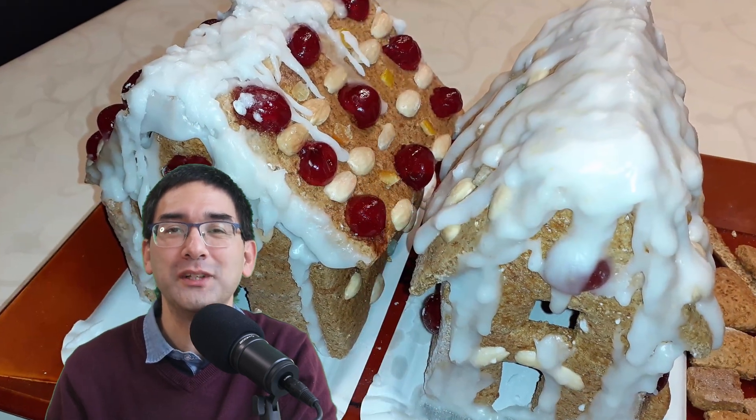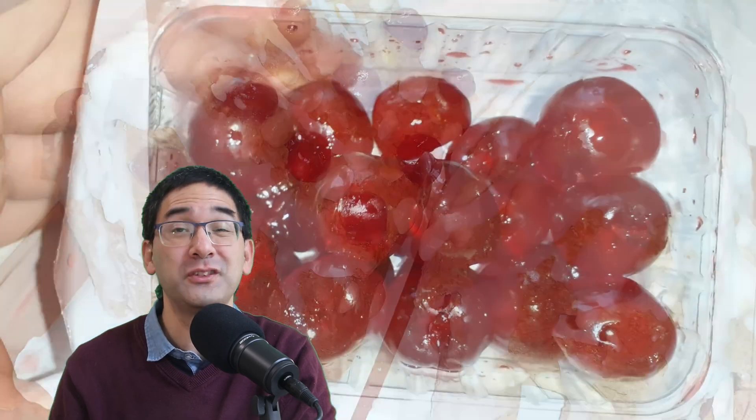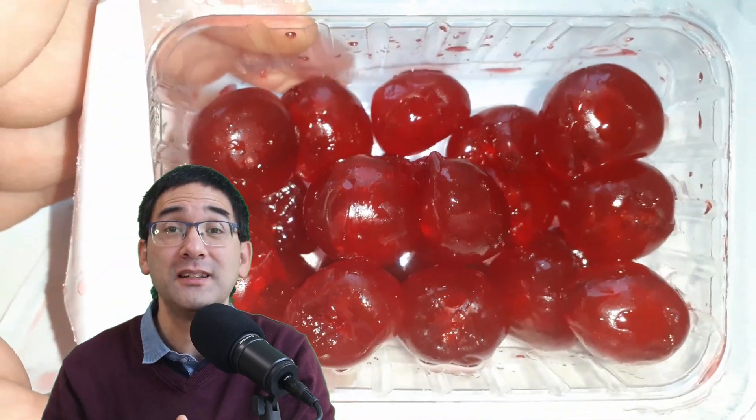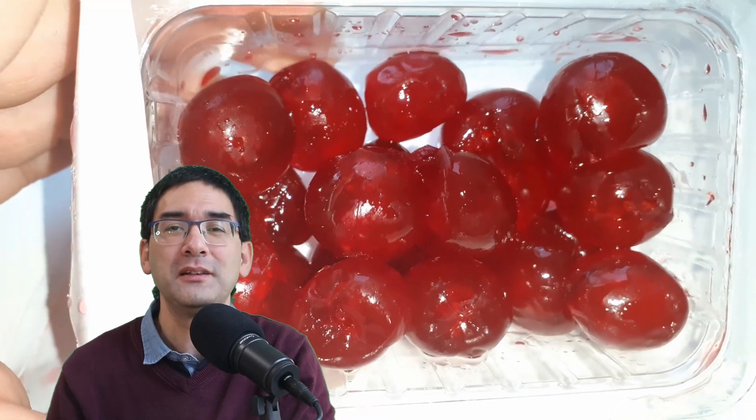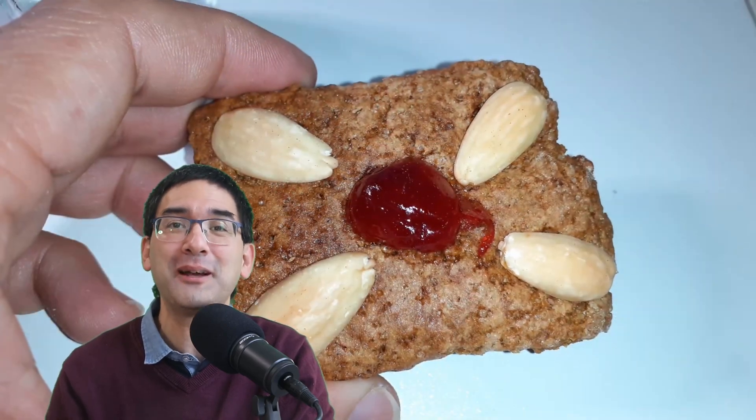They do kind of look very artificial. I thought maybe they were made of some kind of a gelatin substance. They were quite transparent and very, very sweet, and it didn't taste like cherries at all. So I decided, well, I'm going to put it under the microscope to find out.